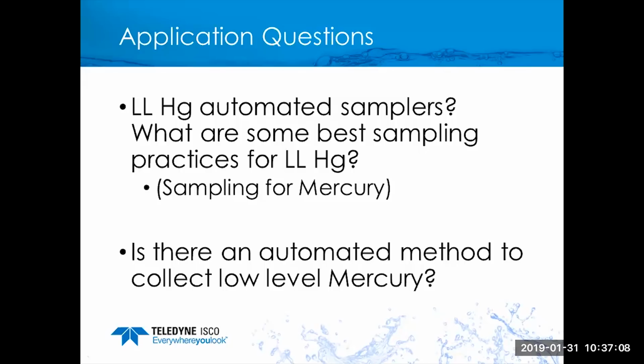Now, any portable sampler could be utilized in that application. Frankly, it could also be a permanent refrigerator for that, but the same rules would apply there for a more permanent stationary unit where you would want to eliminate any sources of metal in the sample transport and utilize plastic bottles.